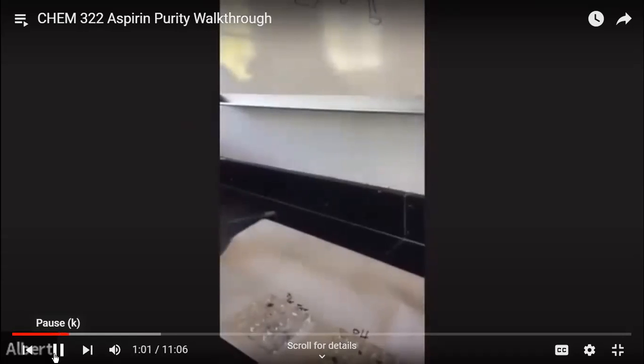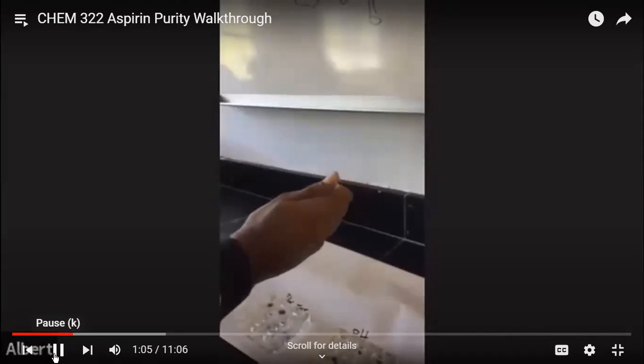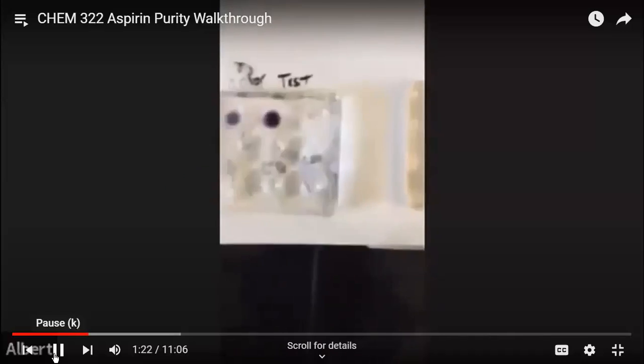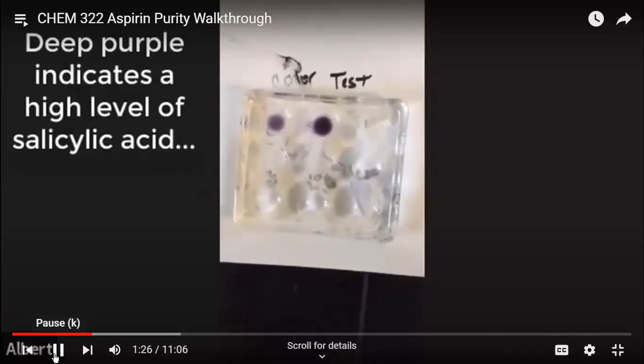So I'm going to add one or two drops to just pure salicylic acid. You can see right away how dark it is. All right, and that's what you expect, because in the video, it said that the iron chloride forms a complex with salicylic acid and it turns purple. So you can see that. Can y'all see that? So the plain pure salicylic acid also turns deep purple.